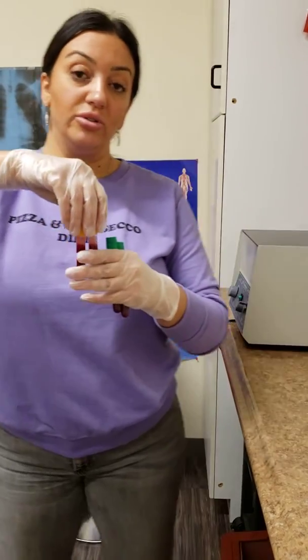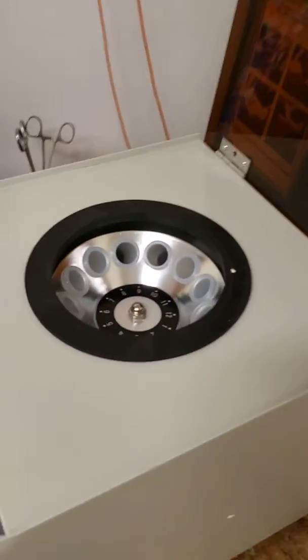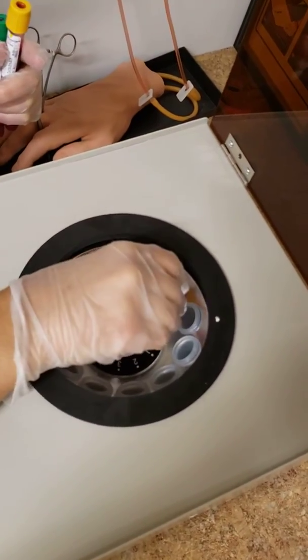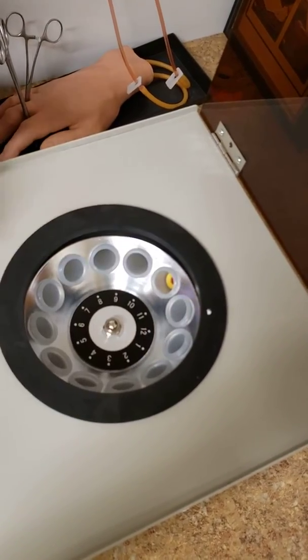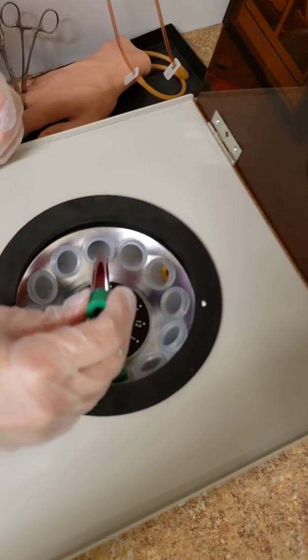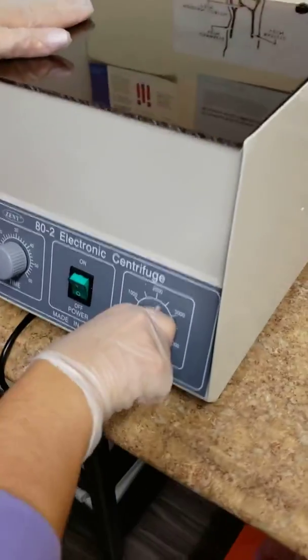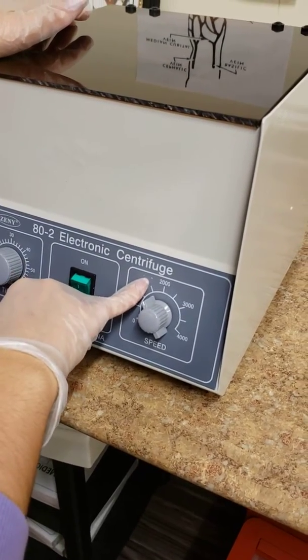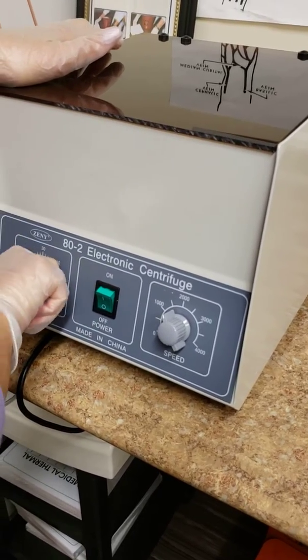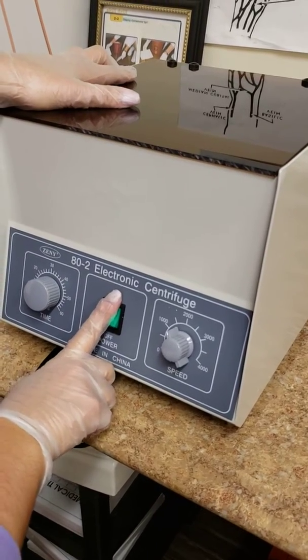So when I load my centrifuge, I'm going to do so by opening the top. I'm going to place the same tubes directly across from one another — directly across — and then the same thing with my heparin tubes. You're going to close the top on the machine. The machine should be set to roughly 1500 RPMs, and then set it to 15 minutes.